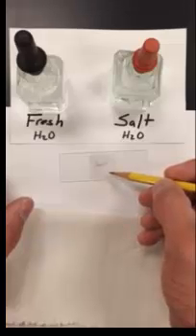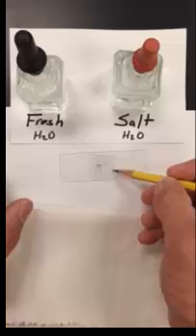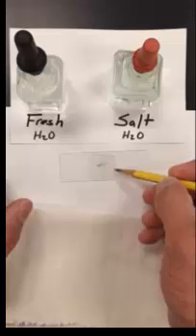And to do that you just want to pull your pencil back and as you pull your pencil back your cover slip will lay down and we do this to prevent or reduce the amount of air bubbles that we'll see under the microscope. And then eventually you're going to pull your pencil out and the cover slip is just going to fall.